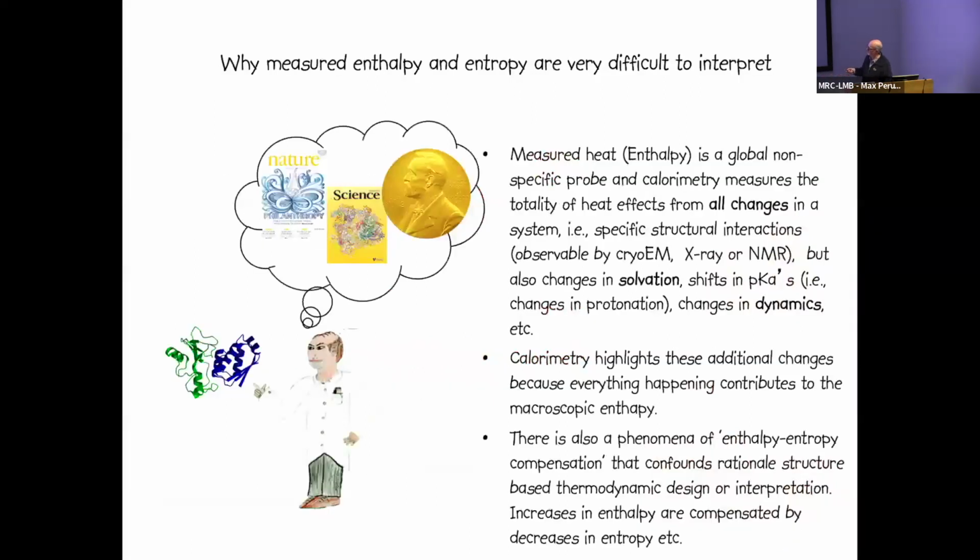So here's the kind of mistake that a lot of people make, including me. When you come into this field of calorimetry, you're thinking, well, I can measure thermodynamics, and these are the fundamental properties that are driving the position of the equilibrium, telling me what the reaction is going to do. And then with protein engineering, I can fiddle around with the protein, add in extra interactions, make the thing bind tighter, discover a drug, become rich, become famous, get lots of papers, etc.